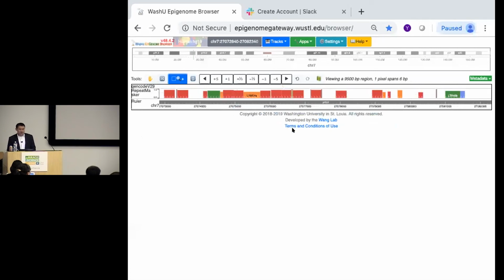This is what I mean by putting a lot of effort into creating a new visual format, right? Better ways of expressing the data. For transposable elements, that's what our research is based on. It evolves around transposable elements, so we've come up with a lot of different ways of looking at them.